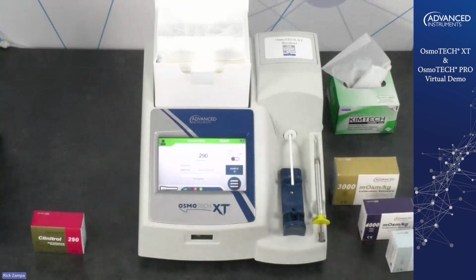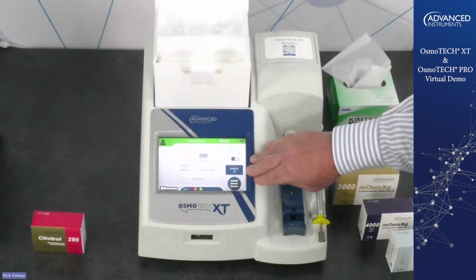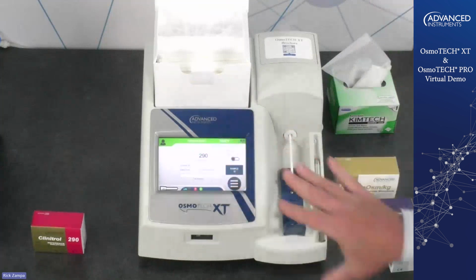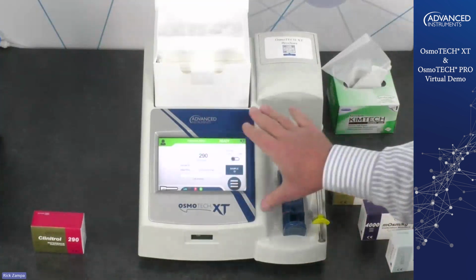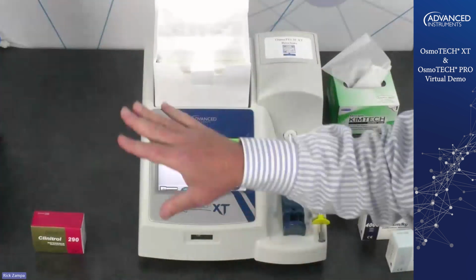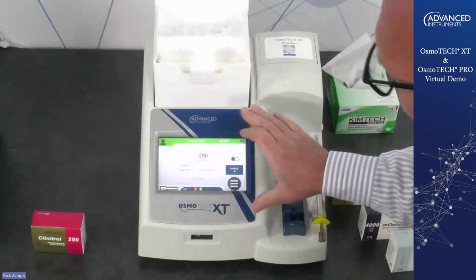So as I said, right now I have the instrument set up in probably its most basic format. I am not requiring user ID login or sample ID at this time. I'm going to show you how all of that works when I go into the menus. And then when we move over to the OsmoTECH Pro, I'll show you how that's set up. I have it set up that requires sample IDs and user IDs. So that one, I'll show you how, when I run a test over there, how that works.